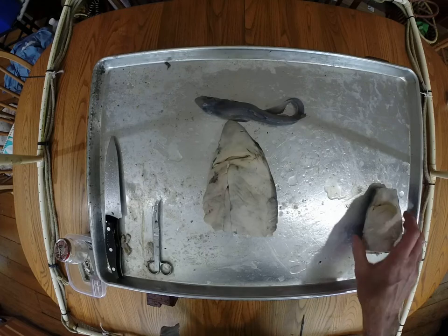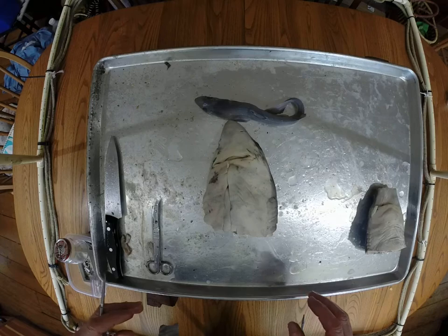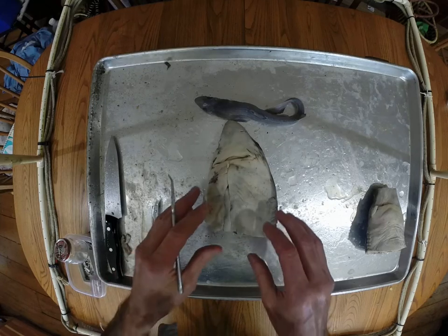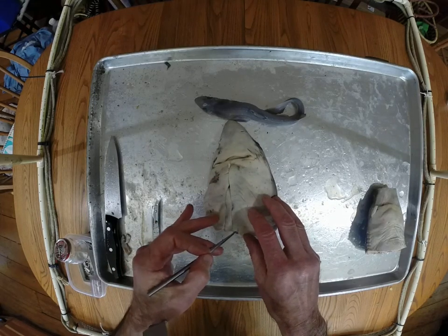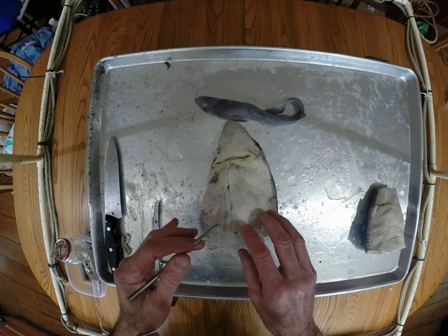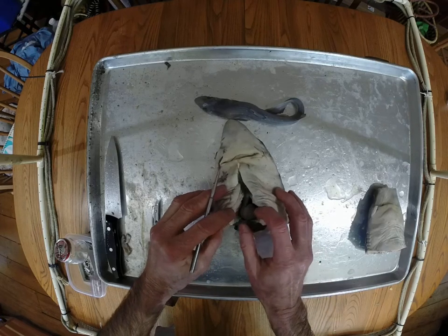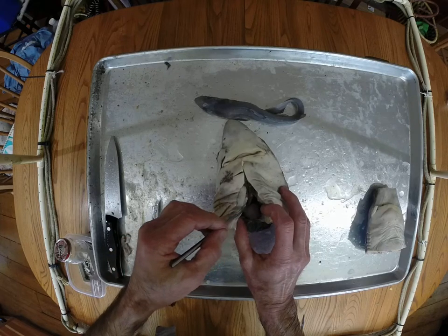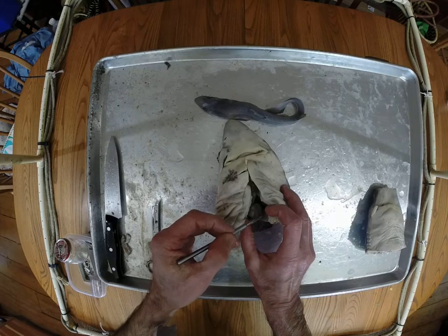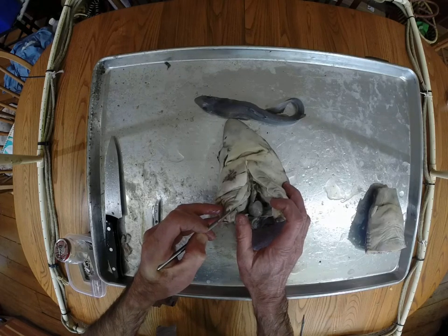Okay, so what I really wanted to do today is to look into the pericardial cavity, look at the heart, some of the branchial circulation, and then look at the structure of the gills. So I've made an incision through the pectoral girdle. The pectoral girdle is the cartilage that supports the pectoral fins. And so we can open this up. And as we do, this then is the pericardial cavity. This is the remnants of the pericardium that surrounds the cavity. And we're looking at the ventral aspect of the heart here.